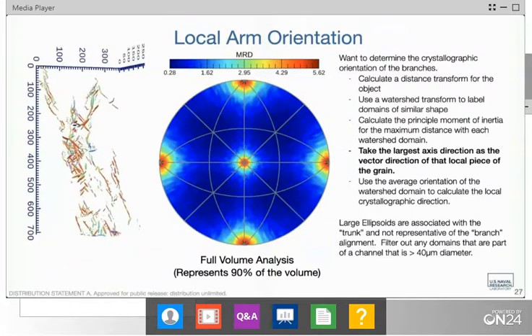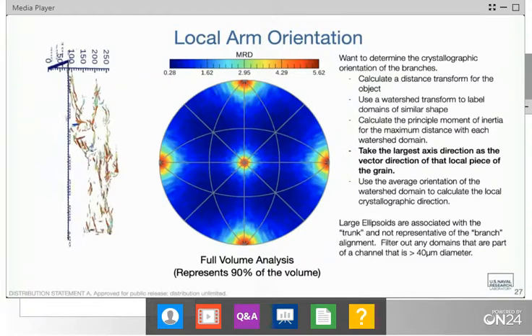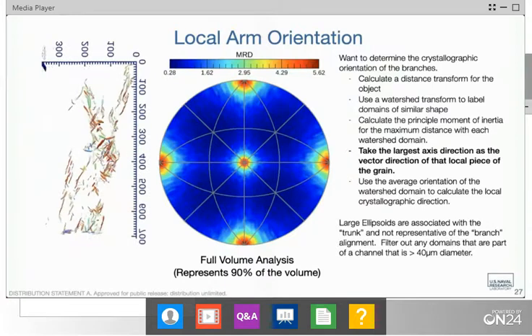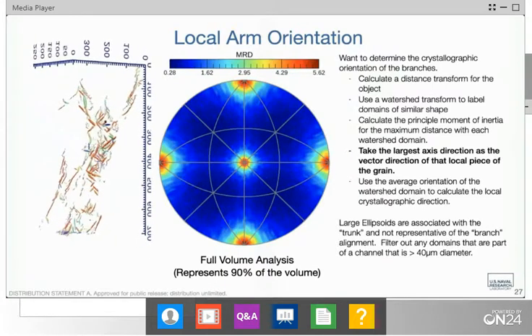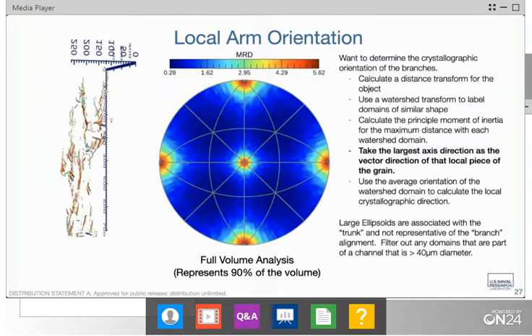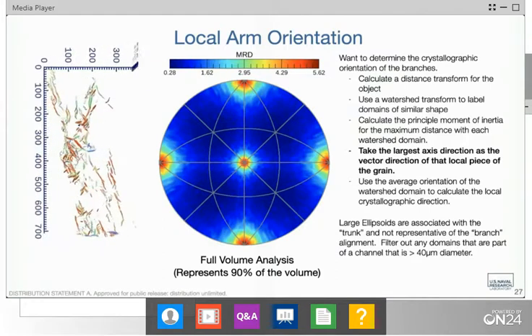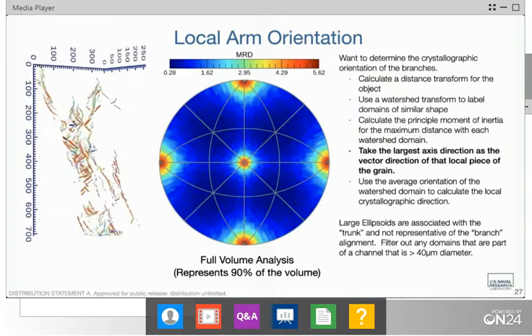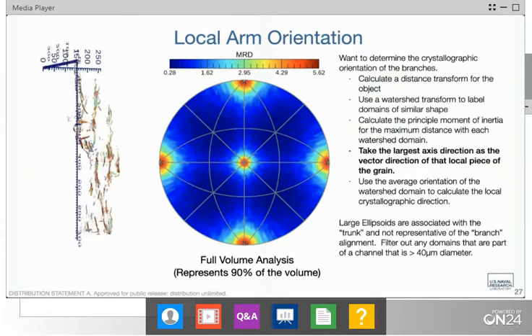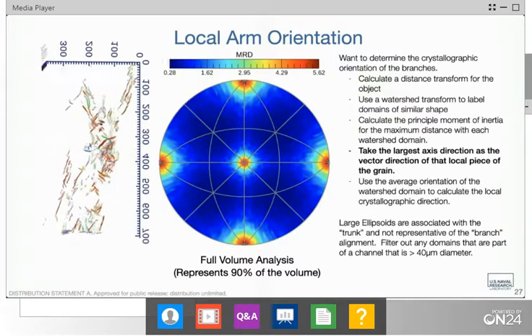That is backed by some work that we've done with Tony Rollett, where he's looked at some synchrotron experiments and looked at the solidification path for 316. It's dependent upon how quickly you're printing, but at these very high cooling rates, they were seeing only an austenite microstructure. And I think that actually applies as well to the powder. And it may very well be too that the powder is getting hot enough from subsequent passes that it is also maybe transforming.